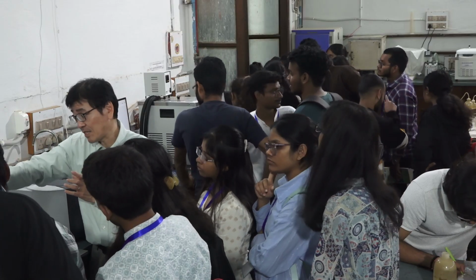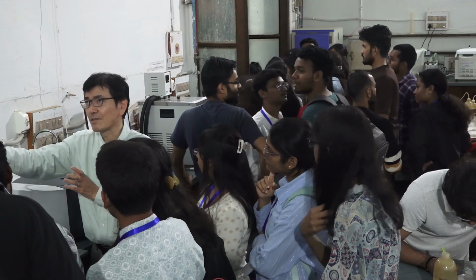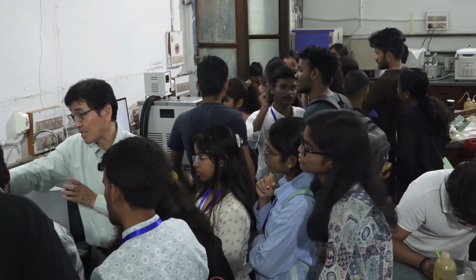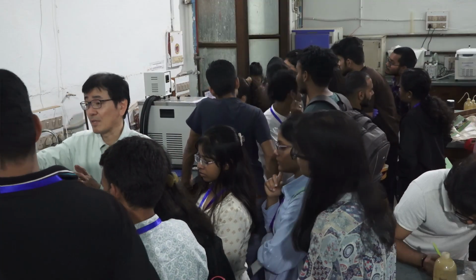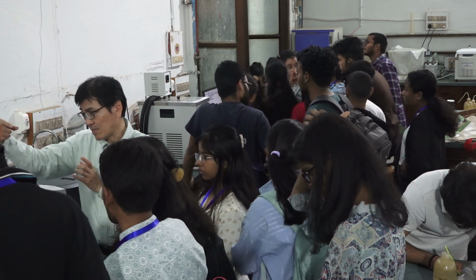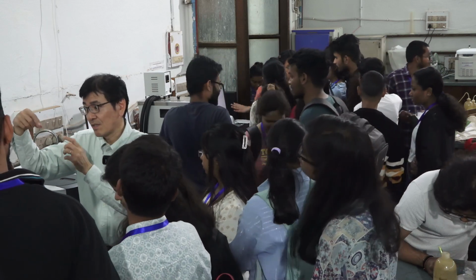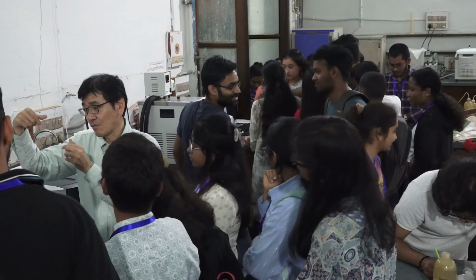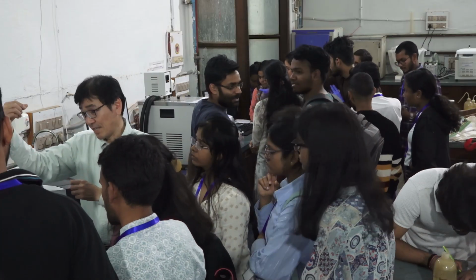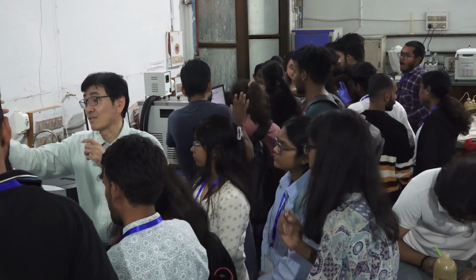If an MCT detector, mercury cadmium telluride, is used, then the upper limit is 6,000 or 7,000. But in that case, the Fourier transform becomes confusing, so we need to take special care if we measure a long range together.